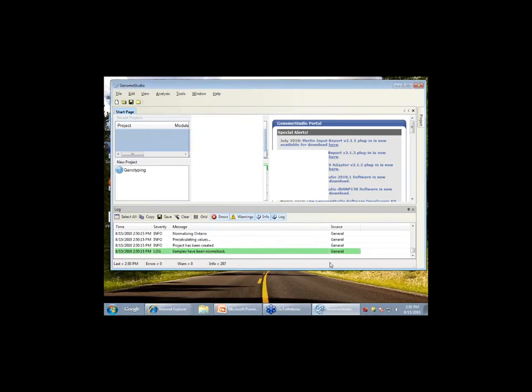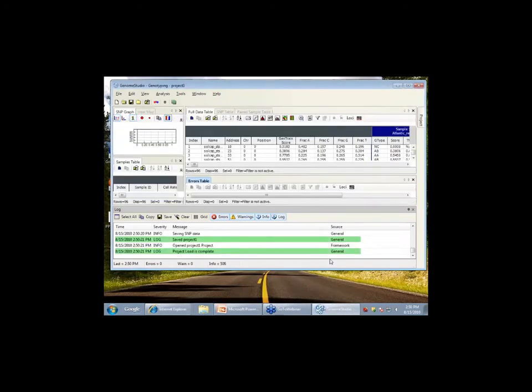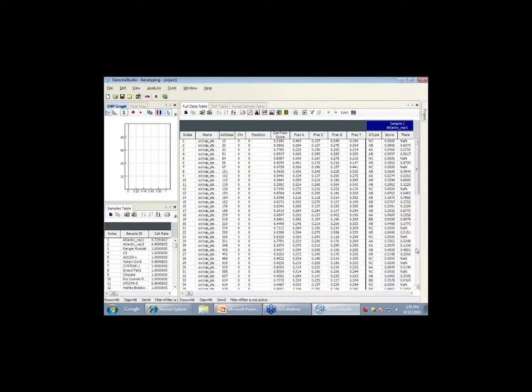And now it's loading all your data. There's a number of windows that open if everything works out. There's actually 5, 6 windows that open, and a number of them are a waste of time, basically taking up space. This is just a log on the bottom window. So I close the bottom window. You notice it just increases the size of your window to full screen. The errors table we're not going to use. Let's just drop that.